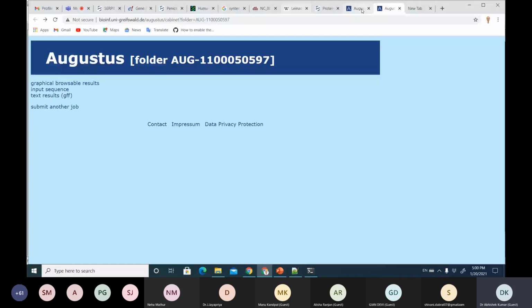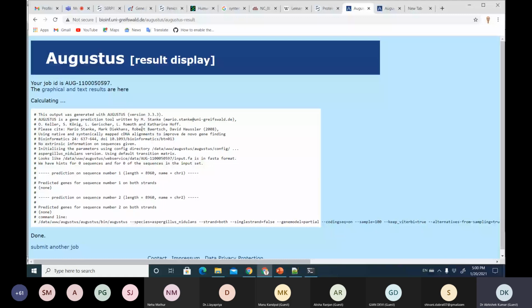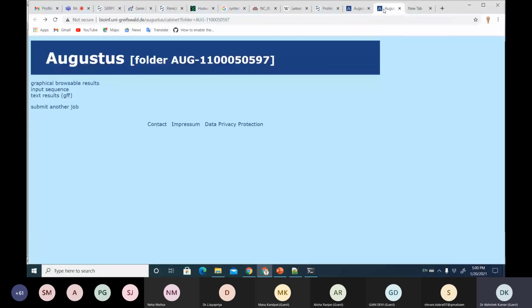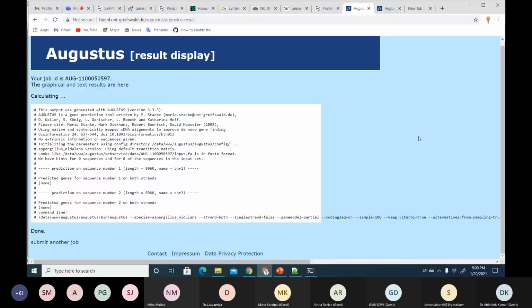As you see, one can run it online, at least to train. Obviously when you're doing this, you need to optimize it yourself with the dataset, and do the gene prediction. So this is one method of making gene predictions. Can I make a gene prediction with my eyes? Yes, it is possible if your eyes are smart.